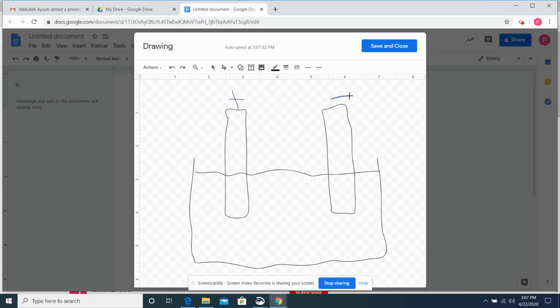And so we got the electrodes now, and we know that we have copper chloride in this liquid. All right, well, you can tell from the name that it's made of copper and chlorine. But you're going to find out what happens there, and then you're going to make particle drawings of this. Okay, and so let's see, what else do you need to know for this drawing? The positive electrode is going to be in the drawing. It's going to be the one that is, or in the video, it's going to be the one that's hooked up to the red wire, and then this one's going to be hooked up to the black wire, just so you can tell them apart.